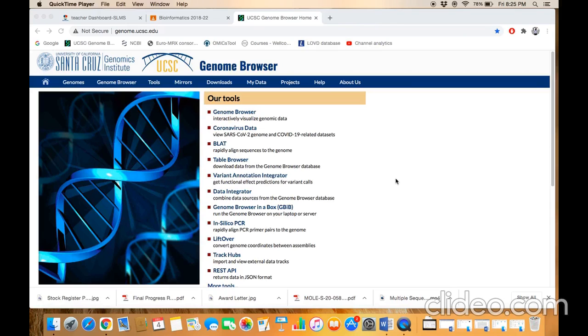Bismillah ar-Rahman ar-Rahim. The topic of our discussion is BLAT. BLAT is an abbreviation of BLAST-Like Alignment Tool. This tool is used for finding locally highly conserved, most similar regions across the length of the genome.